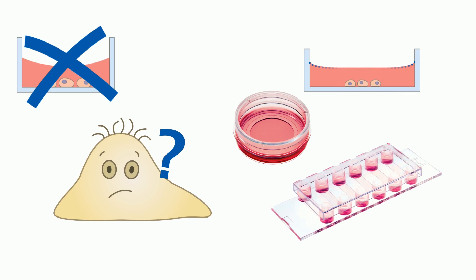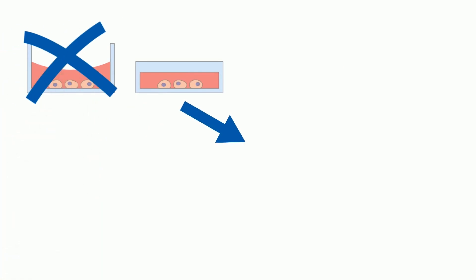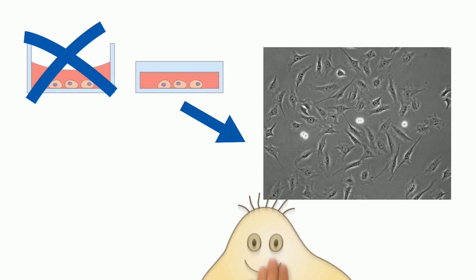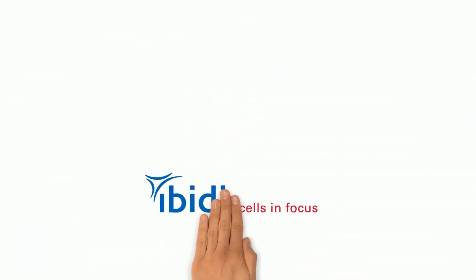You can use the ibidi channel slides, for example. In these slides, meniscus formation is geometrically impossible, resulting in excellent phase contrast images and happy scientists.